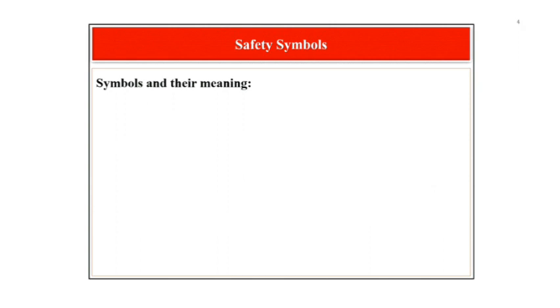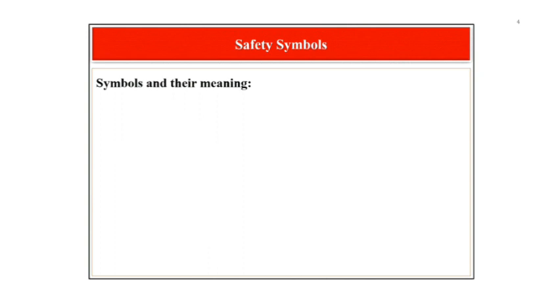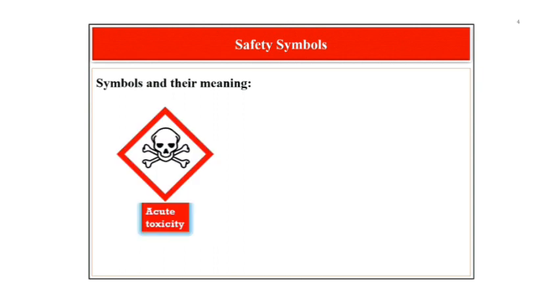The next symbol is the symbol for acute toxicity, which includes a skull and crossbones. The toxic material symbol indicates the presence of substances that may harm an individual if they enter the body. The possible routes of exposure to toxic materials are through inhalation, skin contact and ingestion. For example, gases like bromine, cyanide and carbon monoxide.